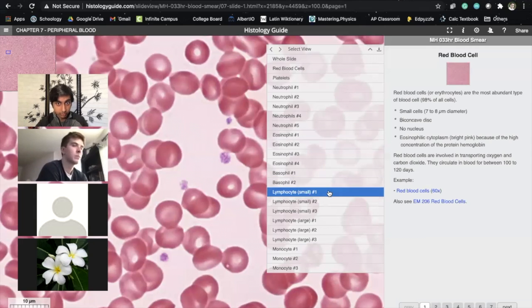Okay, what was the next thing I'm looking at? All right, a lymphocyte. These are part of your adaptive immune response, which is basically you have your immediate response, and then a little bit later you have a specific response to a specific antigen, whether that be a specific microbe, a specific part of a microbe, or maybe an allergen or something. And so a lymphocyte actually adapts. It's part of the adaptive response, which evolves and then responds to an infection after some time. It's a bad explanation, but I'm trying not to talk too much biology and immunology here.